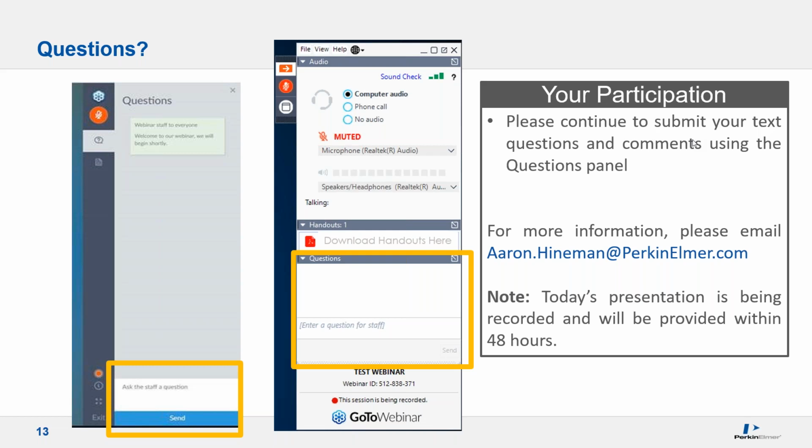And then when you're reviewing your data, looking at reference materials and so forth, look for peaks that shouldn't be there, right? Look for those interferences and try to identify what that is through the wavelength identification tools in the software, and then run a single element of that element to determine if correction is needed and what type of correction. That's just another example where MSF would be great. Though that sounds like a lot of work you have to do up front, it's a one-time thing. You will not need to do it regularly.